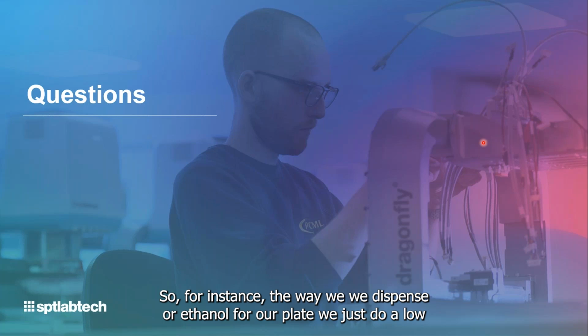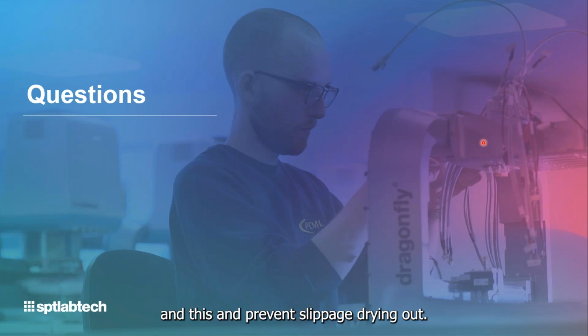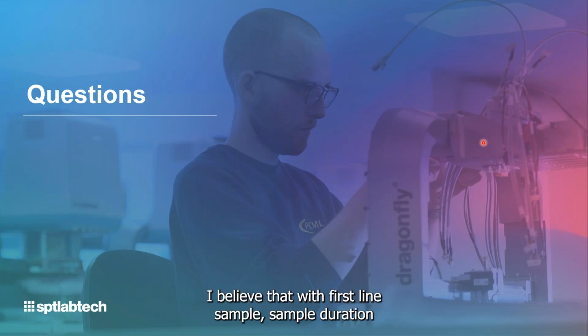So for instance, the way we dispense our ethanol to our plate, we just do a low volume dispense, say 20 microliters to each well of the plate, which only takes a minute. This prevents our beads drying out, and is a way of getting around any time variation you might see across the plate. Whilst we haven't got data for a full plate of samples yet, we're working on that. I believe that with Firefly, the sample variation shouldn't be much more than what I've shown you here today.